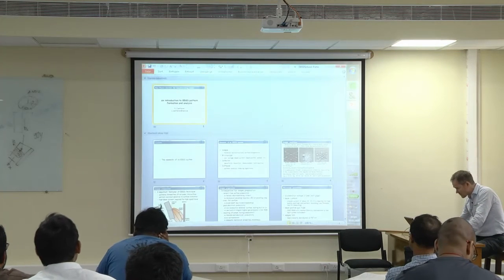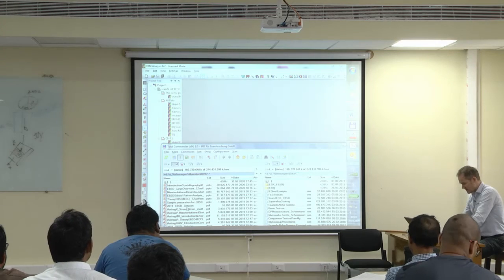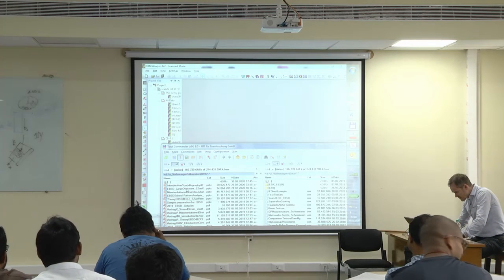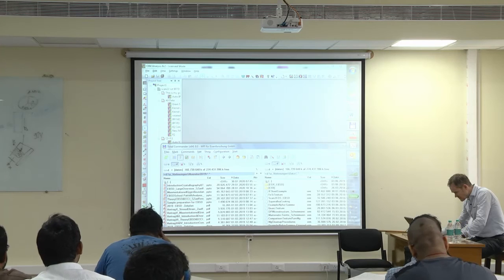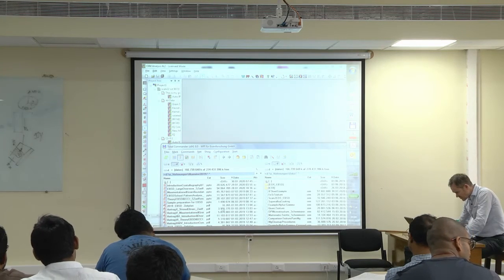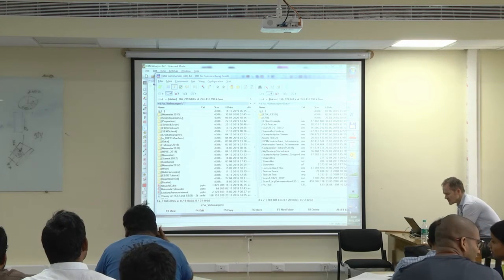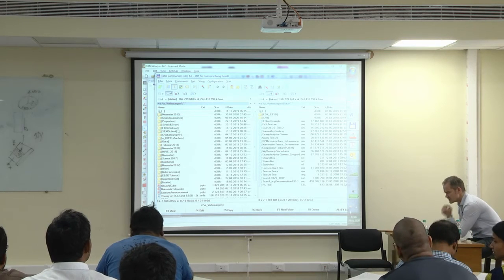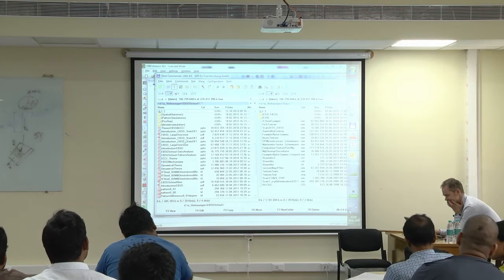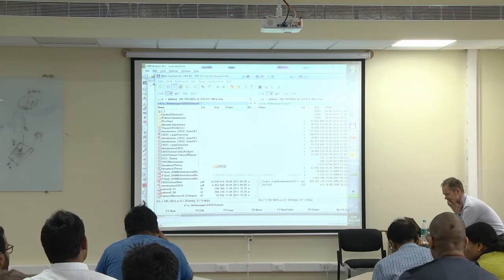Oh no, this is the wrong microstructure. Then I need to show you this as an example without calculations. That's not nice. Where is it? With the large overview, grain misorientation, grain boundaries, pattern analysis. There should be something different. Where is it? Data analysis. Yes.